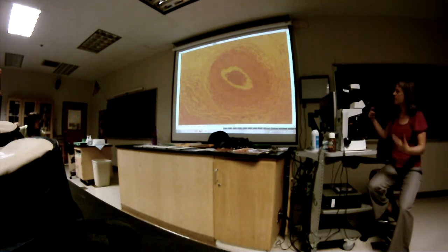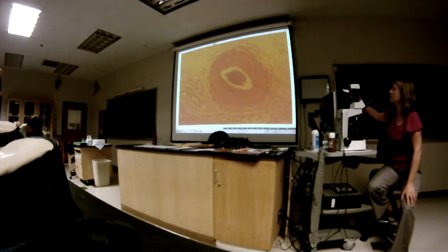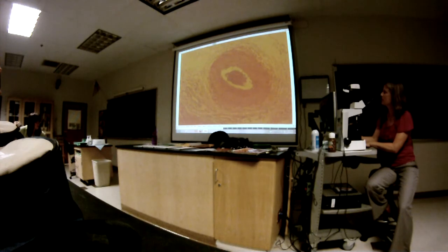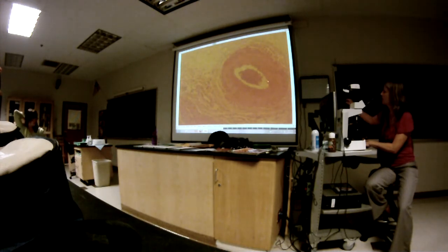Organs tend to have main layers and then sublayers. So that was the main layer. That was the main layer. And then this main layer in here. Yeah, tunica intima. Or interna, either is okay. Intima and interna, same thing. I don't know why they're so similar. Okay. So tunica intima is the innermost layer. Tunica intima and tunica interna, are both the innermost layer.